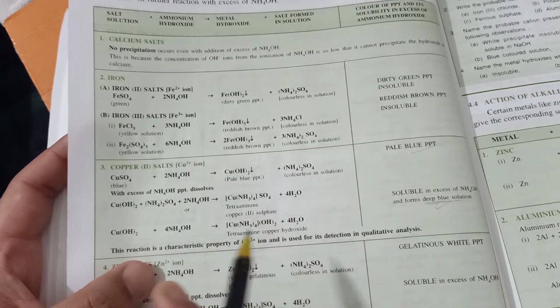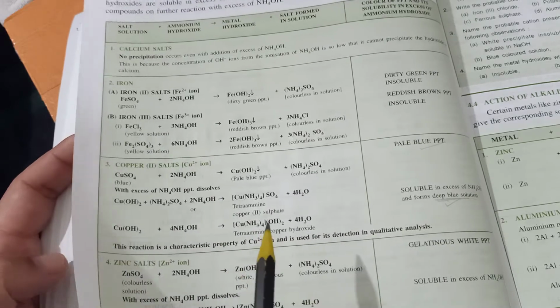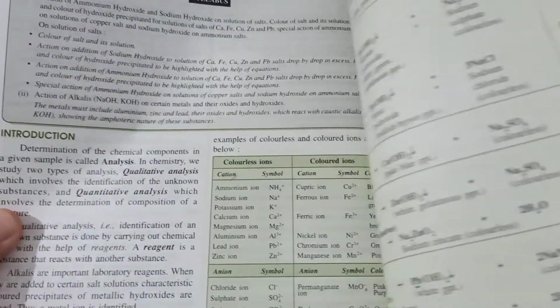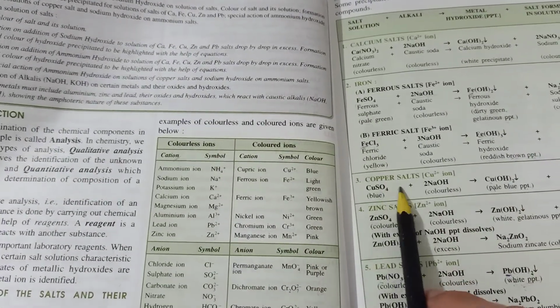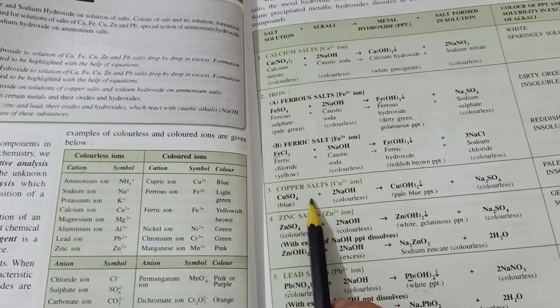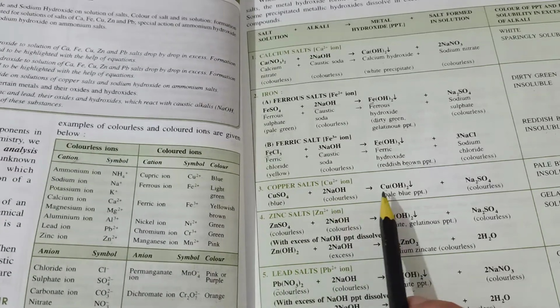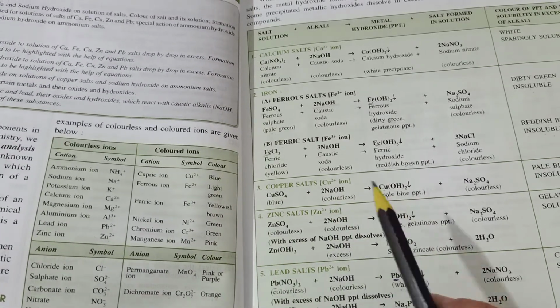Now this is a little different reaction compared to the reaction of sodium hydroxide. Let's go back to sodium hydroxide. Copper salt, on treatment with sodium hydroxide alkali, also produces a pale blue precipitate initially.